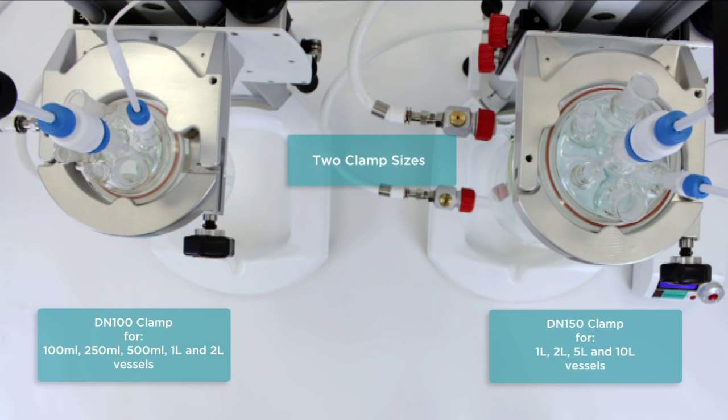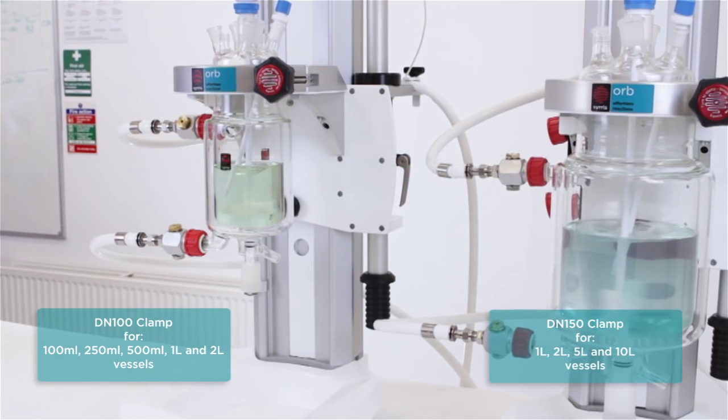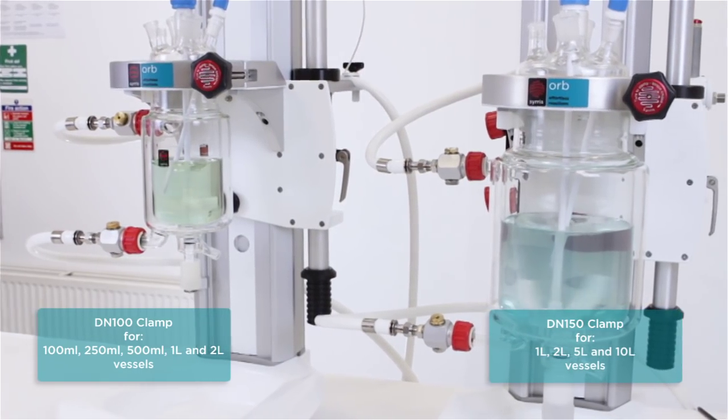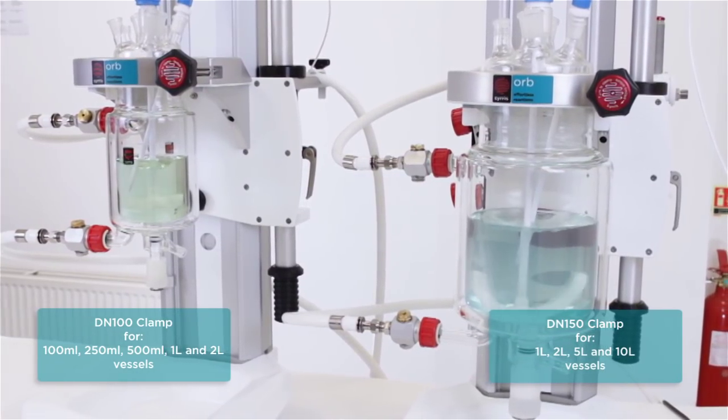Orb features two clamp sizes, which can be quickly and easily interchanged to accommodate a wide range of vessels from 100 millilitres to 10 litres.